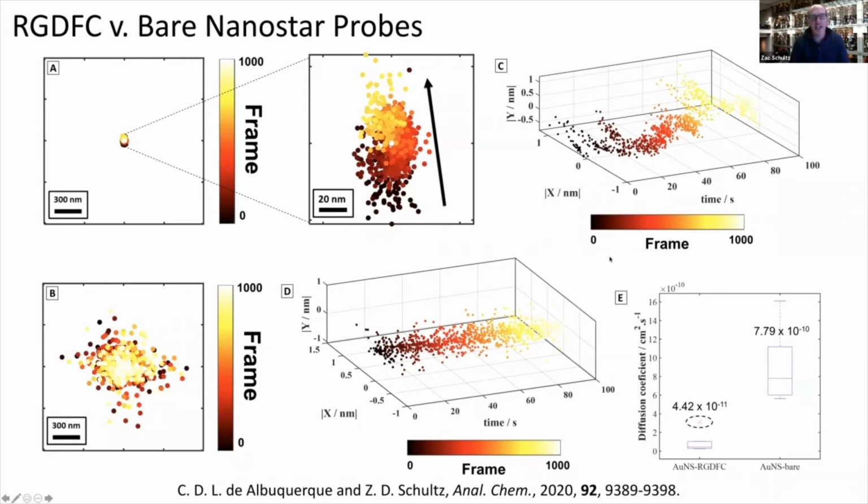of the cell. If we look at a nanostar that doesn't have the peptide to bind to the protein, we don't see any of this wagging or improved localization. In fact, the super resolution algorithm comes back with something that's about 300 nanometers, which suggests that we're not super resolving it. It's moving around and producing a broader signal than is produced by a specific binding of these peptide nanostar interactions.